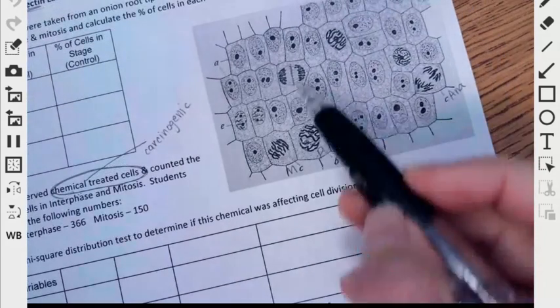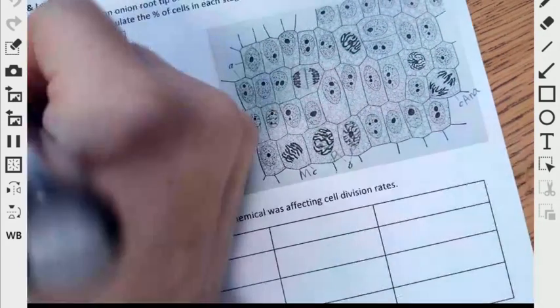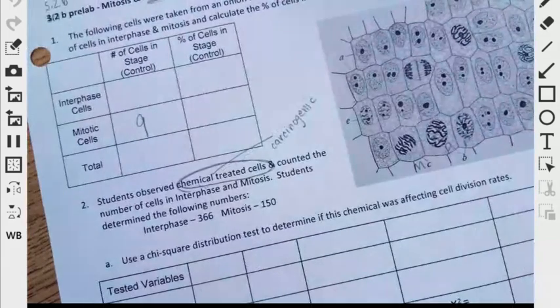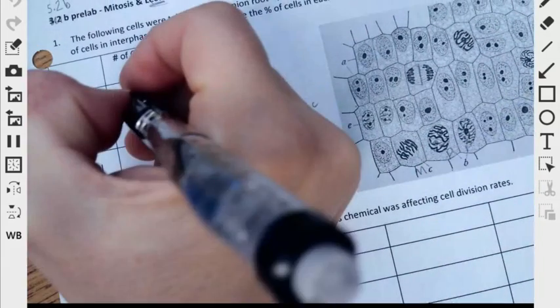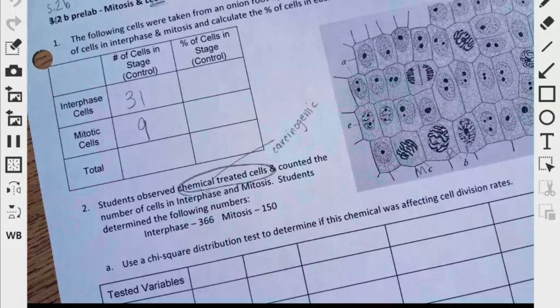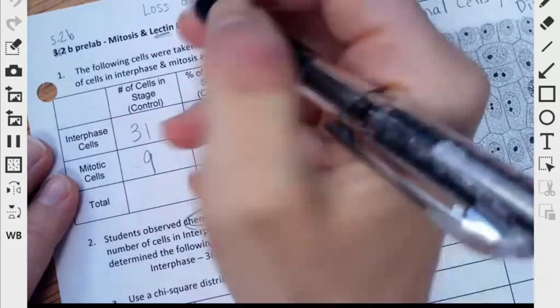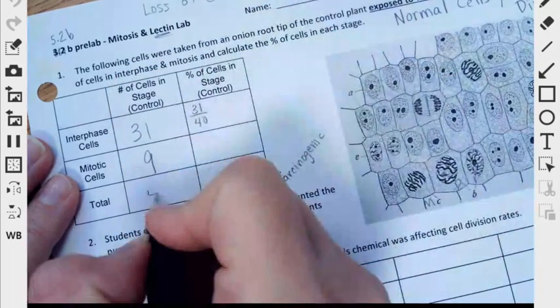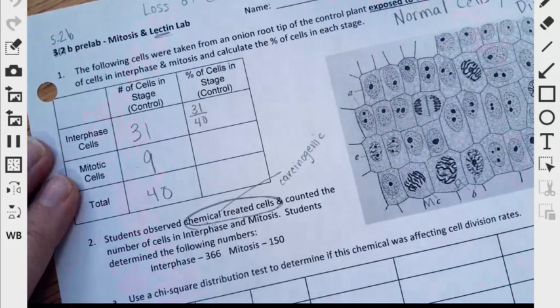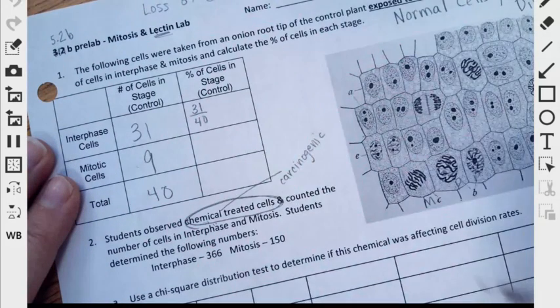But all in all, if I count the number of cells that are in a stage of division, I came up with 9. So I'm putting that over there. And cells that are not in an active stage, I counted 31. So if we figure out the percent of the cells that are in these two stages, again, part divided by whole, 31 divided by 40, there's 40 cells total that I analyzed. And again, these are normal cells.